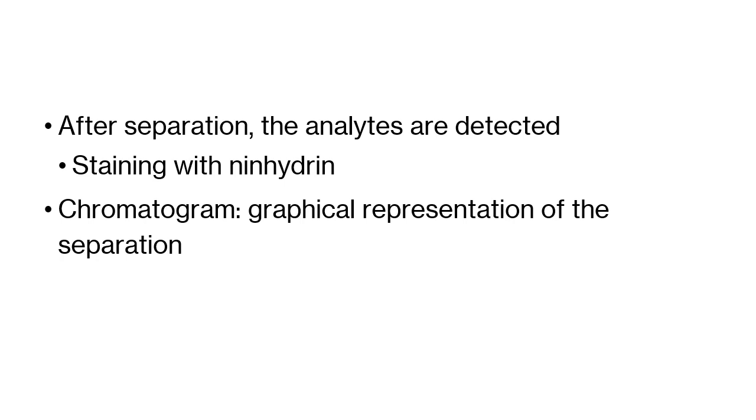After the separation, we are going to detect your analytes. In the laboratory, we let the filter paper dry, then you check the solvent front and the distance traveled by the solvent, and the distance traveled by the sample, the analyte. After you separate and dry, you visualize the separation. What we did was stain it with ninhydrin.